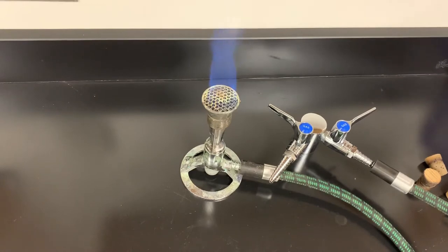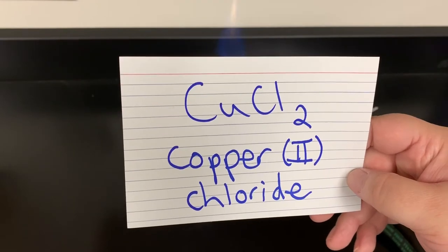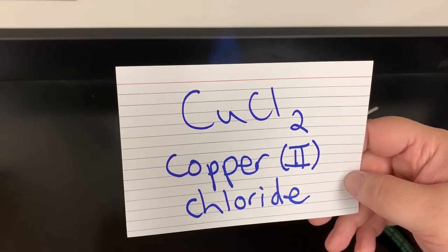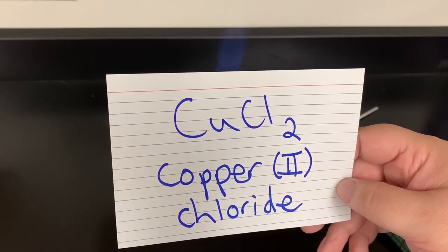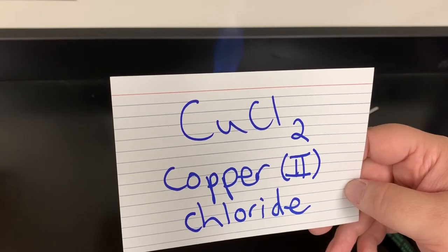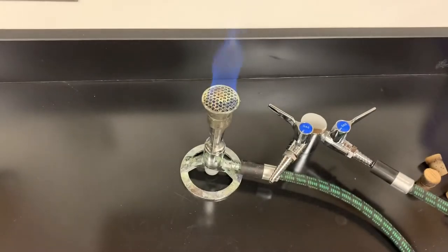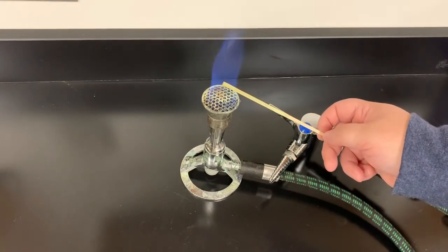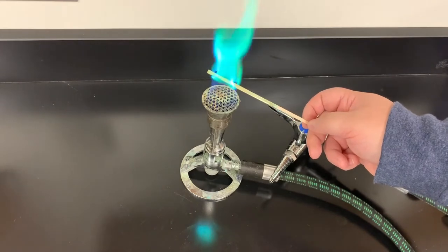The last one for part one of our video is copper(II) chloride. Make sure you have the two there for the copper, because copper changes its charge — sometimes it's a plus one, sometimes it's a plus two — so you have to indicate whether it's a one or a two. Copper(II) chloride goes in here and we get a lovely green color.